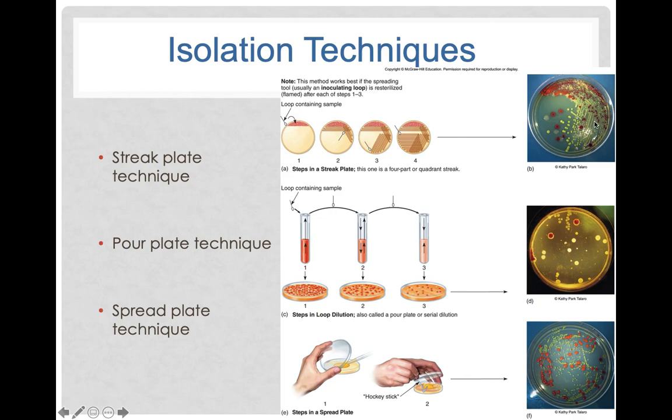And you just keep going, keep going, and then they get more and more spread out. Oh, there's a little white, kind of clearish colony in there. You can even see these over here. You've got red, white, and red, yellow, and that whitish clear. You can see these over here, that they were there. So what you can do is go in here and scoop this little yellow guy up, all one species, scoop this little red guy up, all one species, scoop this little guy up, all one species. Test them for their independent results, get reliable, repetitive results, and figure out what's going on. Whereas over here, if you just take this sample and try to test that, you've got all three of these species mixed together. Who knows what you're going to get?